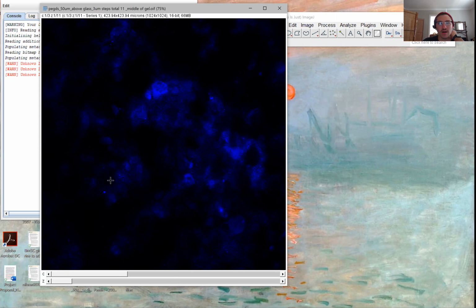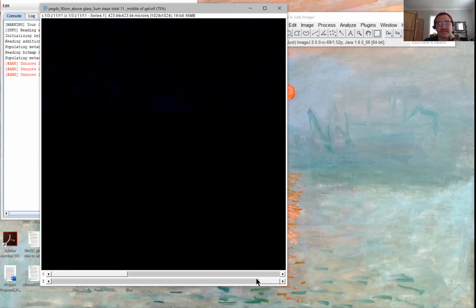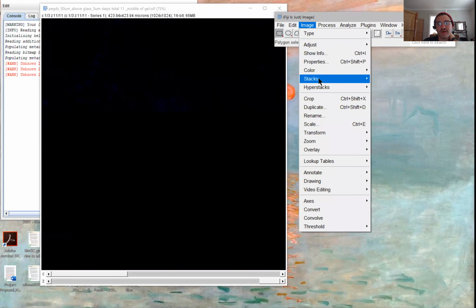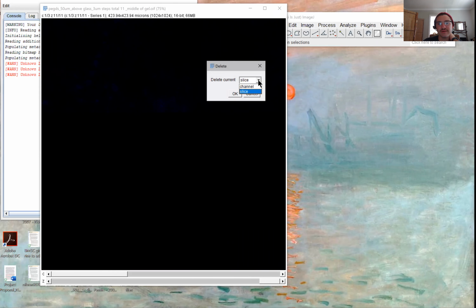And so say you want to delete some of your slices, or you only want, say, 20 microns of the slice you took. You can go to whatever slice you want and go to Image, delete slice, and it's going to delete it. It's going to ask you, do you want to delete the current slice or the channel?